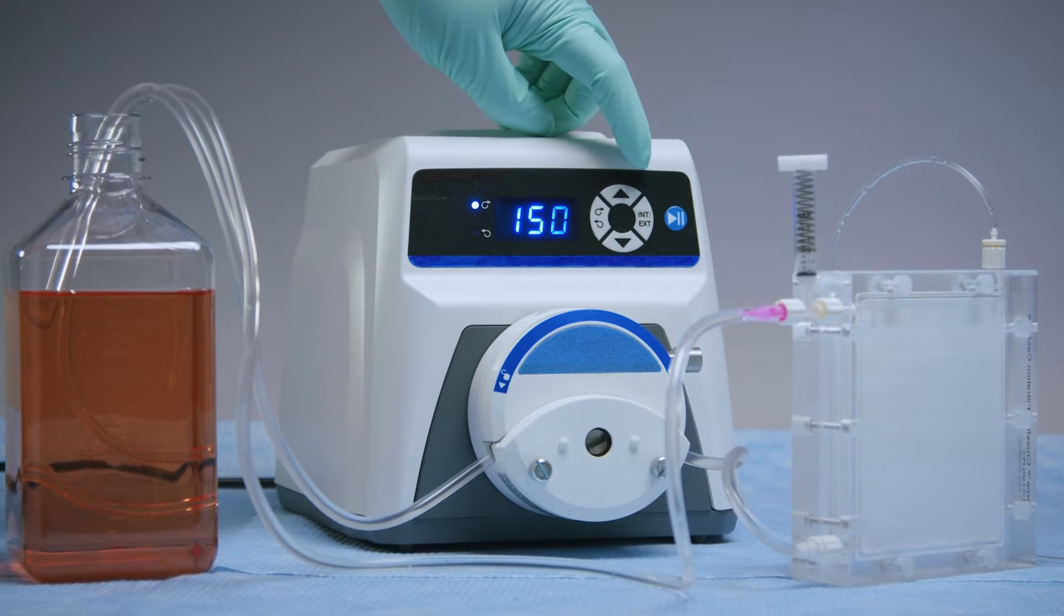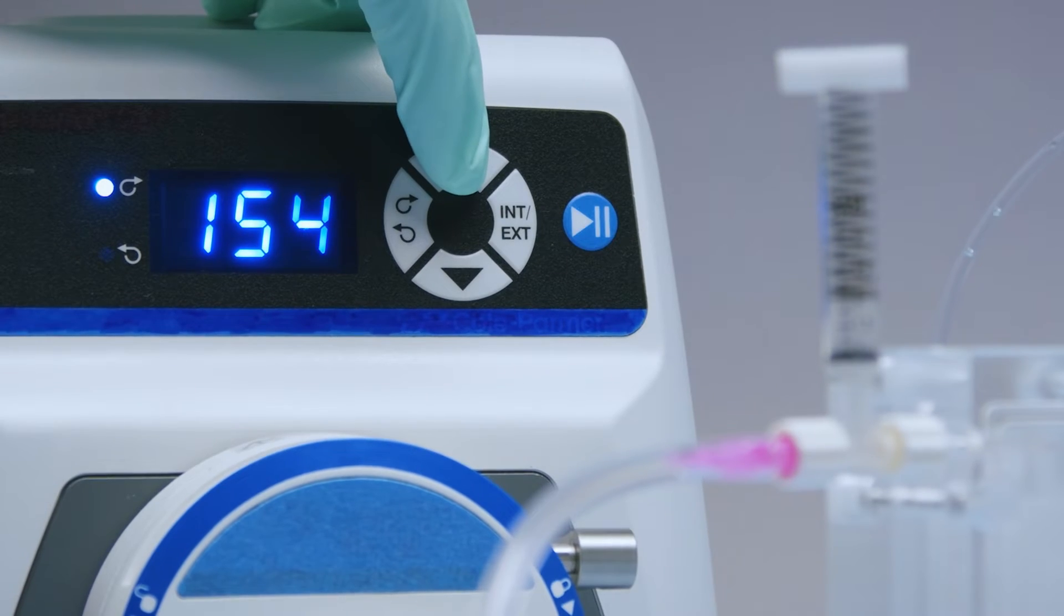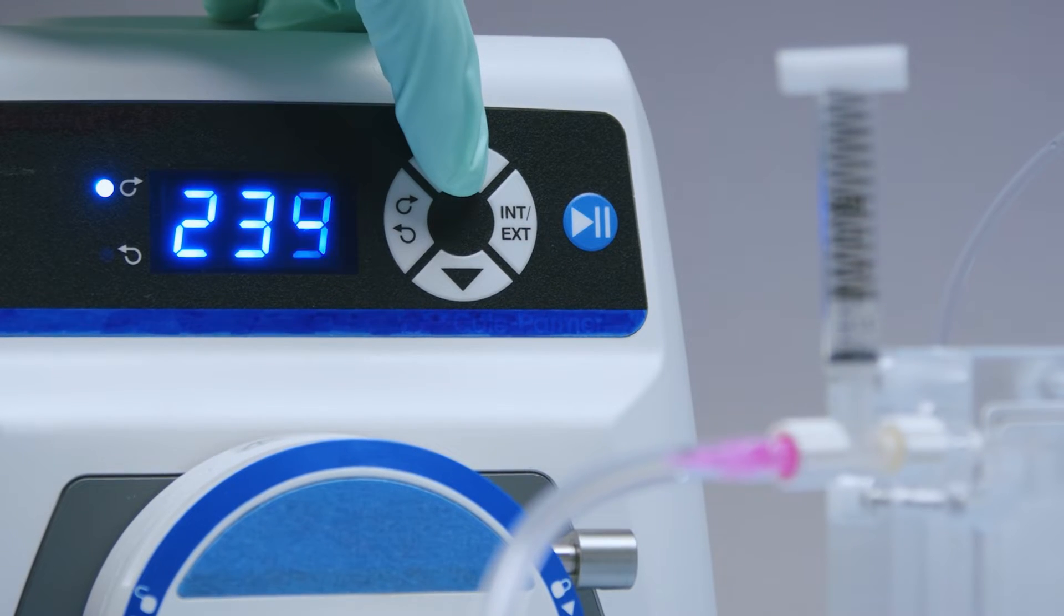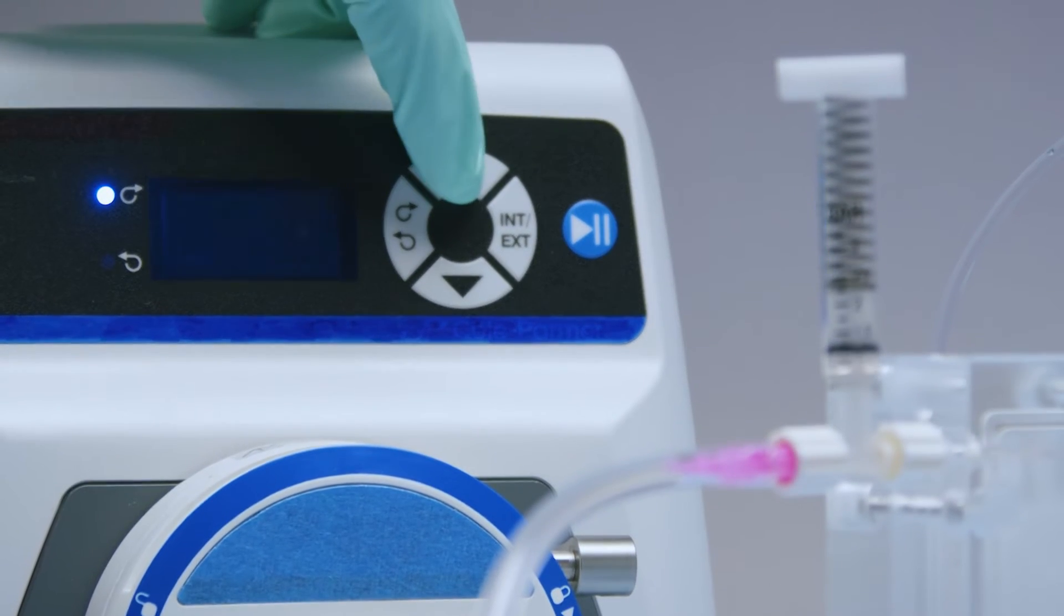Following assembly, turn on the pump and adjust the flow rate until the pressure gauge reads 1.5. In less than 5 minutes, you're ready to go.